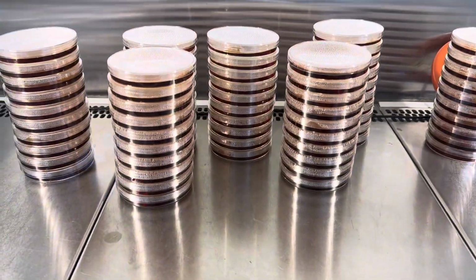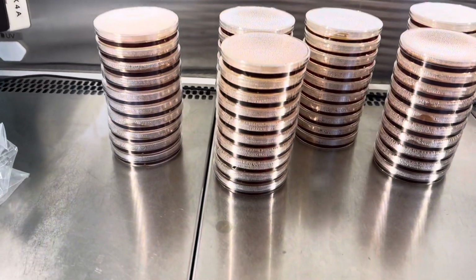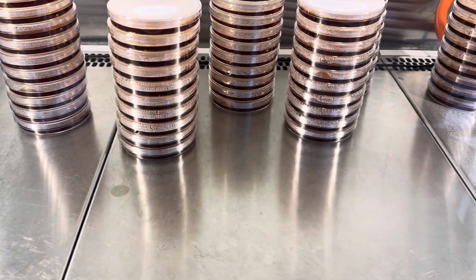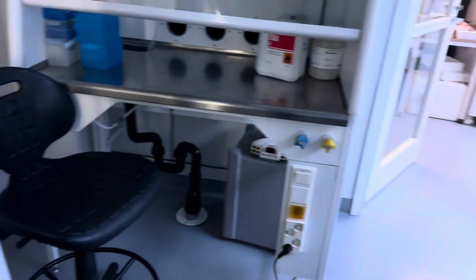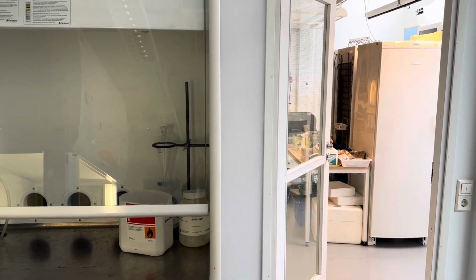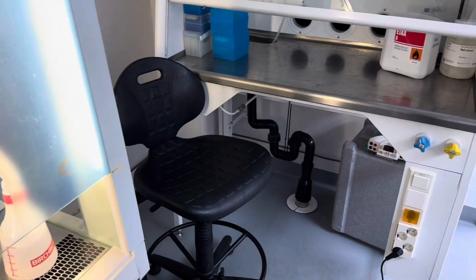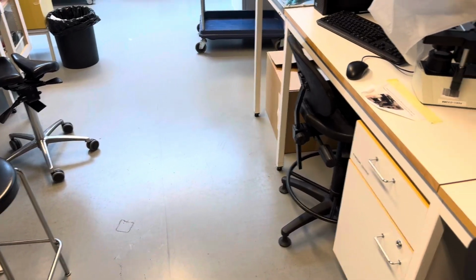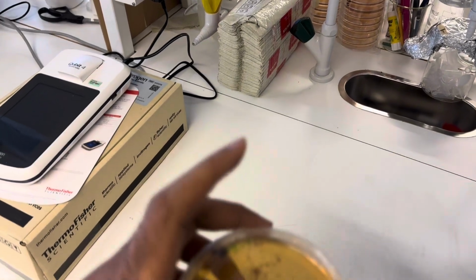Alright, so now I have poured that malt extract medium into these Petri dishes. You can see that these dishes are filled with the malt extract, and now I am going to put sawdust or wood powder onto these plates. Alright, now I have already sprinkled sawdust of wood on my plate, as you can see here.